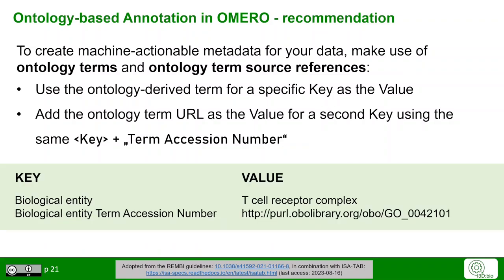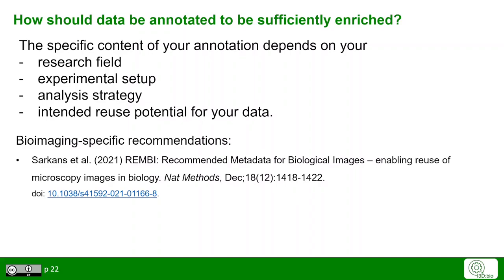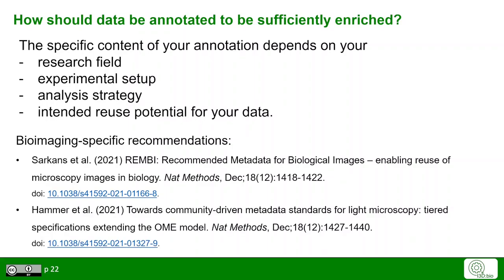For example, use the key-value pair with key "biological entity" and value "T-cell receptor complex", then add a second key-value pair with key "biological entity term accession number" and the URL resolving to that ontology term. How you annotate data depends on your research field, experimental setup, analysis strategy, and intended reuse potential. There are recommendations for bioimaging-specific metadata such as the REMBI guidelines (Recommended Metadata for Biological Images), and more tailored guidelines for specific sub-communities. Review the i3dbio website at i3dbio.de for more recommendations.